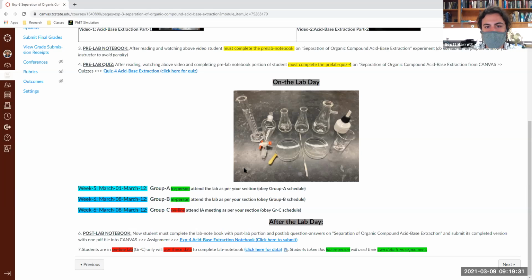And then you have your separation funnel and your watch glasses, and then you have your spatula, and you have your plunger here. They're missing a glass pipette here. But regardless, and then a Buchner funnel here on the right as well. So just kind of listing out these ideas to you.